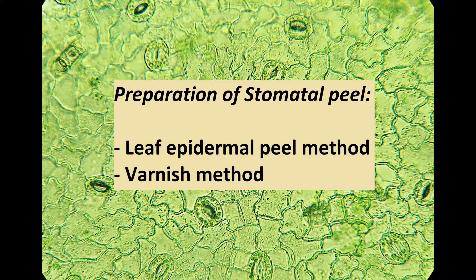In this experiment, we'll be preparing temporary slides of stomata for their structural study using two simple methods: the leaf peel method and varnish method.